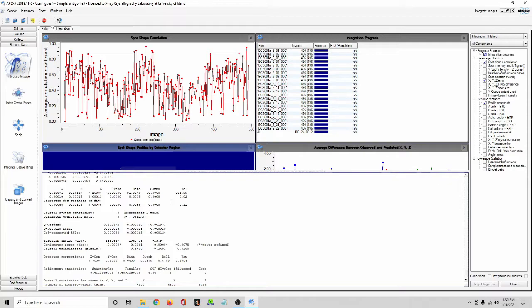And the other thing is the satellite peaks were relatively intense relative to the sublattice. So that's not always going to be the case. You may not even recognize that a structure is modulated until you use long exposure times and have a really good area detector, a modern area detector. I'm using kind of older equipment, and this was just a good example to demonstrate these things with.